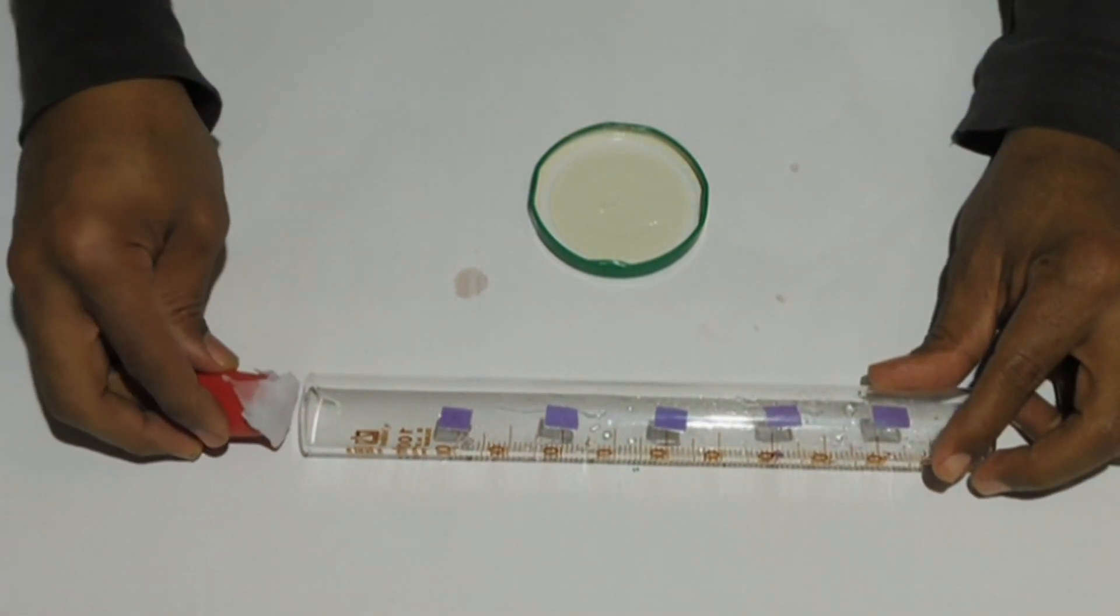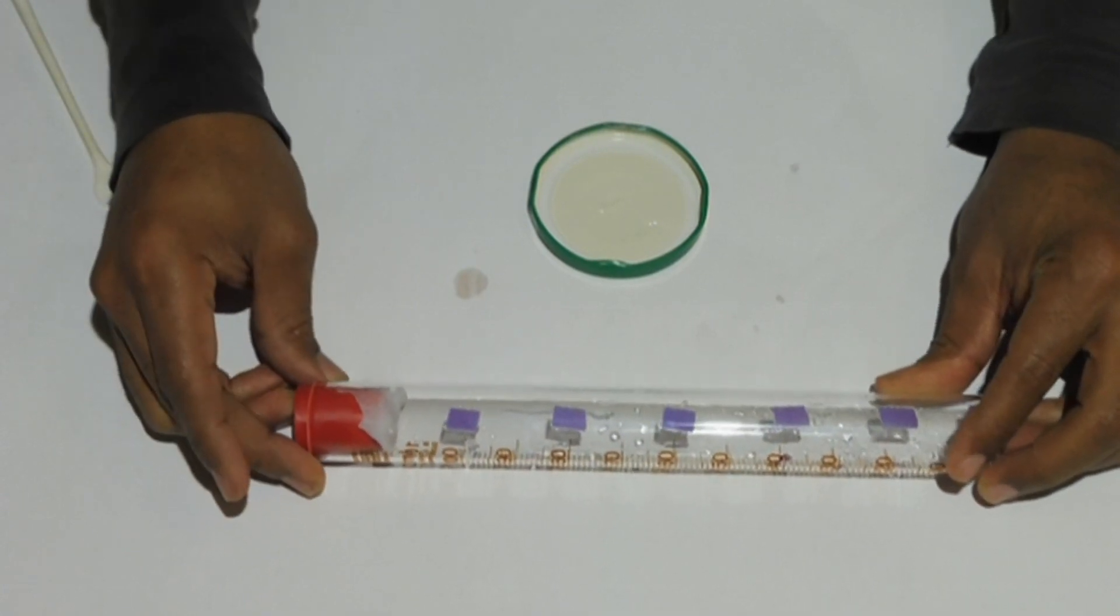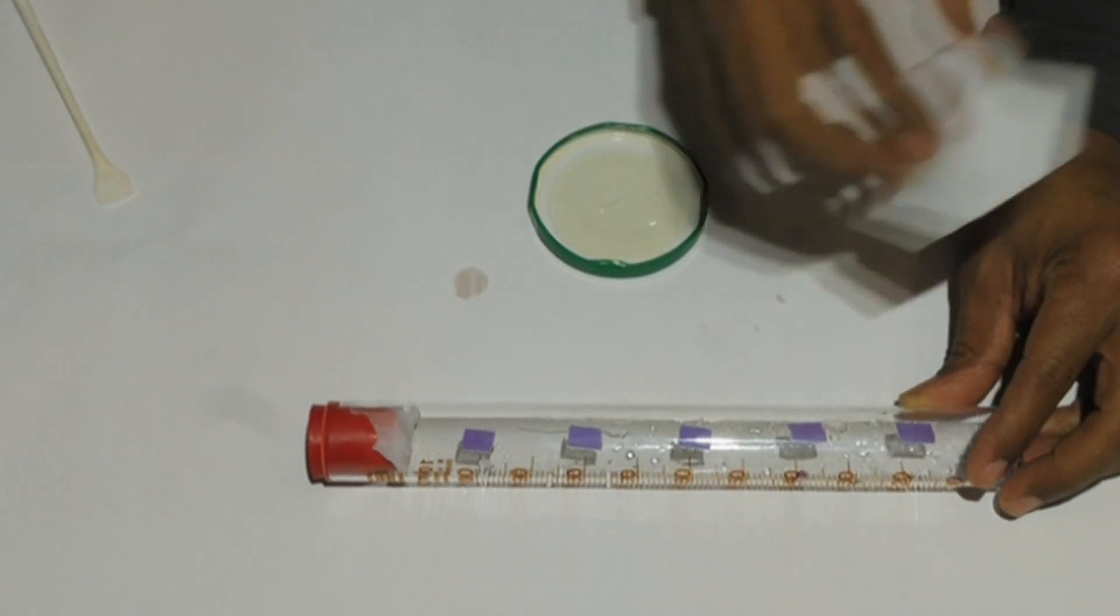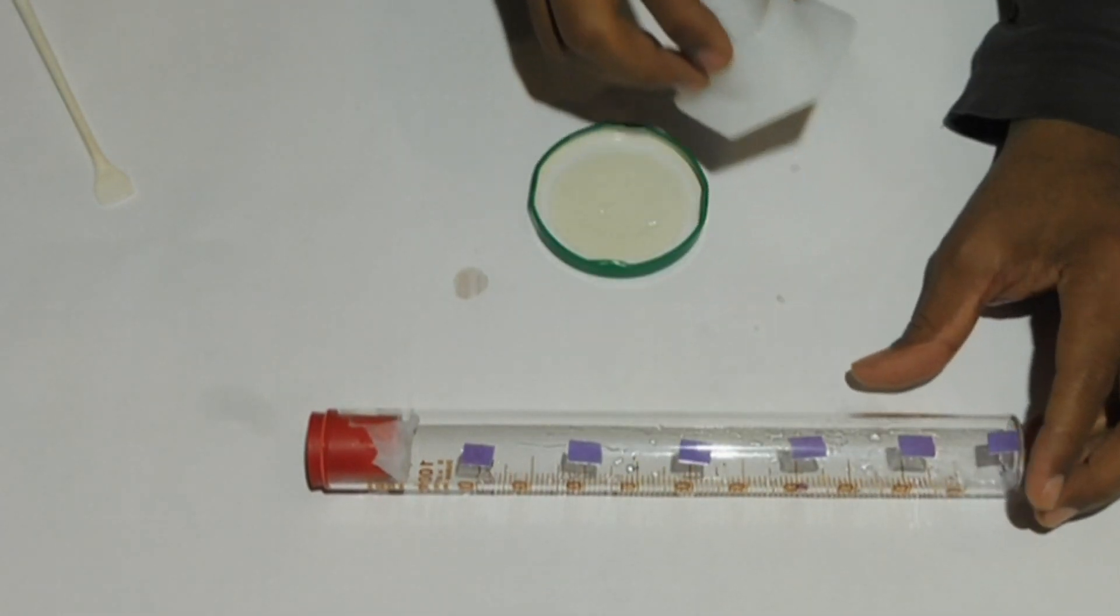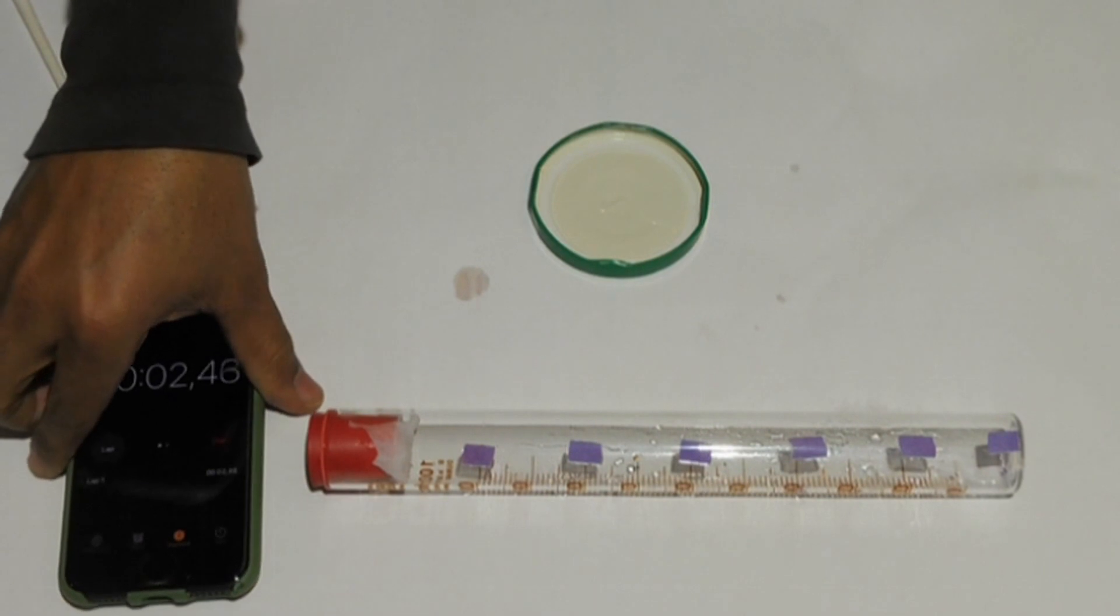Gently close the open end of the cylinder with a rubber stopper. If the cylinder rolls, find means to keep it from moving. Start the timer as soon as the cylinder is closed. As for this time, do not disturb the setup until the end of the experiment.